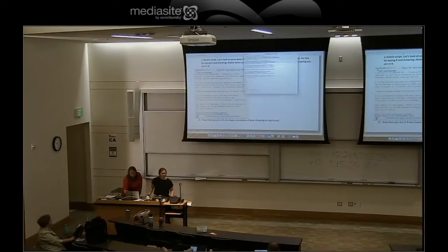At the very beginning, I would like to show you what you see in RStudio and what each panel is, and beyond that, a lot of this you can start to work through on your own.